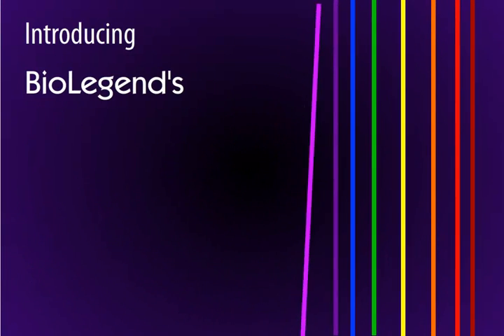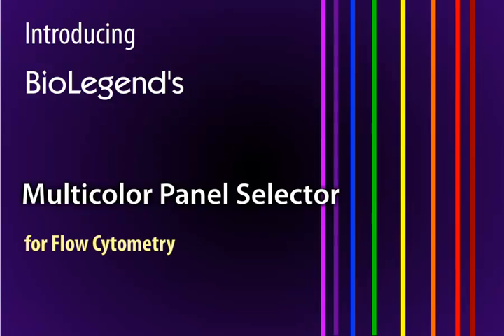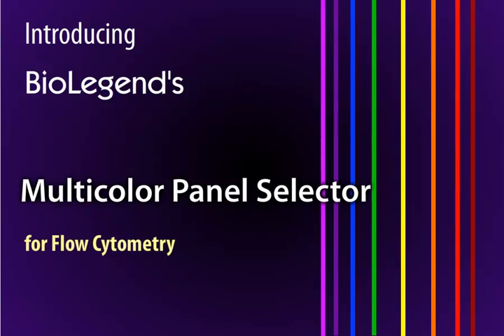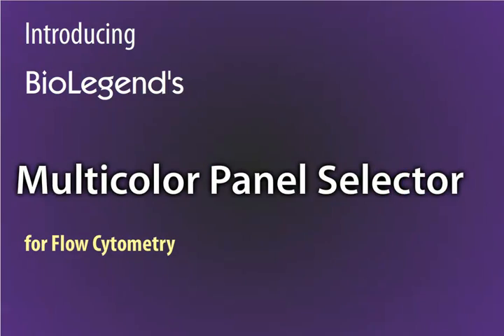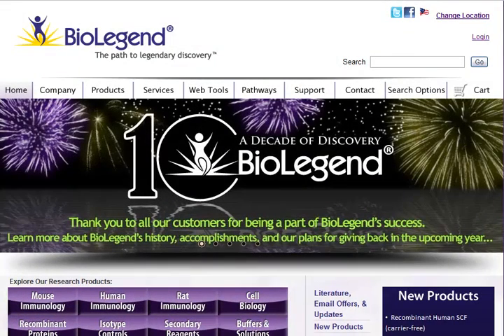Welcome to BioLegend's Multicolor Panel Selector Tutorial. In this tutorial, you will learn how to construct and optimize a multicolor panel for your flow cytometry experiments.